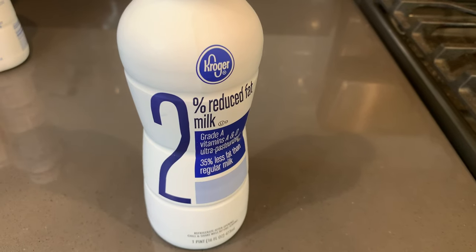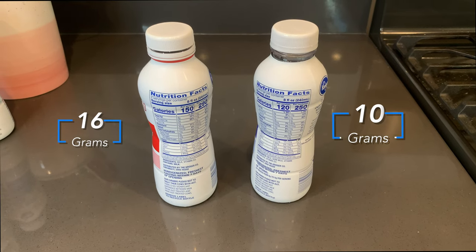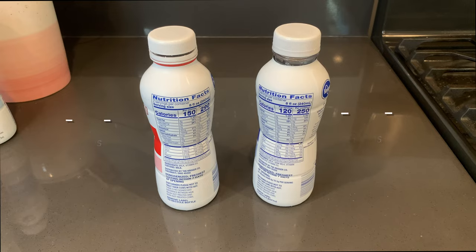Anyway, let's move on to the 2% milk. Now, you might be surprised, but 2% milk doesn't look all that different from whole milk. That's because it only has a little bit less fat than whole milk. Like I said, whole milk is about 3.5% fat. In the case of these two bottles, that means this one is 16 grams and the other one is 10 grams. Can you visually tell the difference?